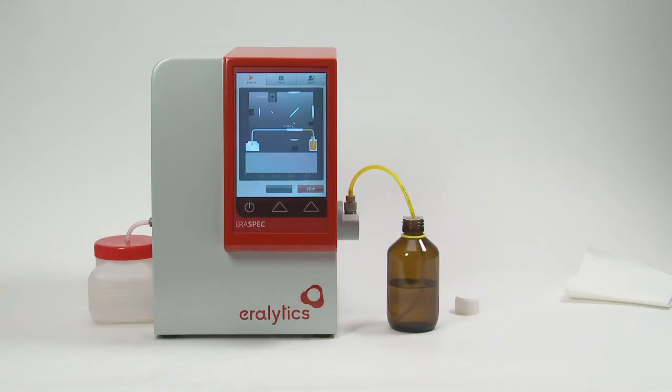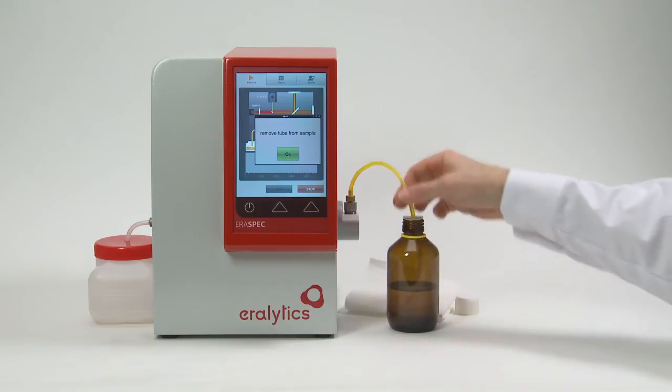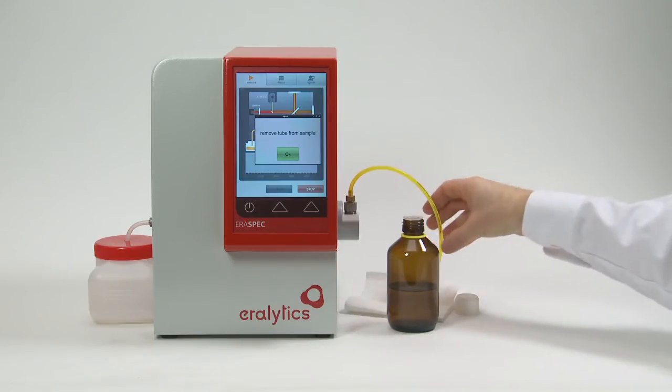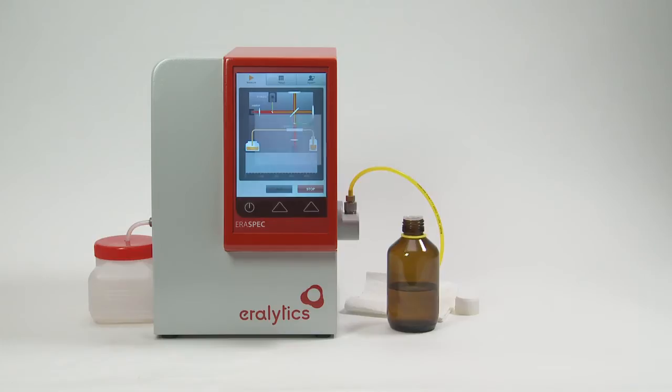The instrument automatically draws in about 12-15 mL sample to rinse and fill the absorption cell and the built-in density meter. At the same time, the IR source is switched on. When the system is completely filled with sample, please remove the inlet tube from the sample container and confirm this on the analyzer. ERASPEC now measures the IR spectrum.